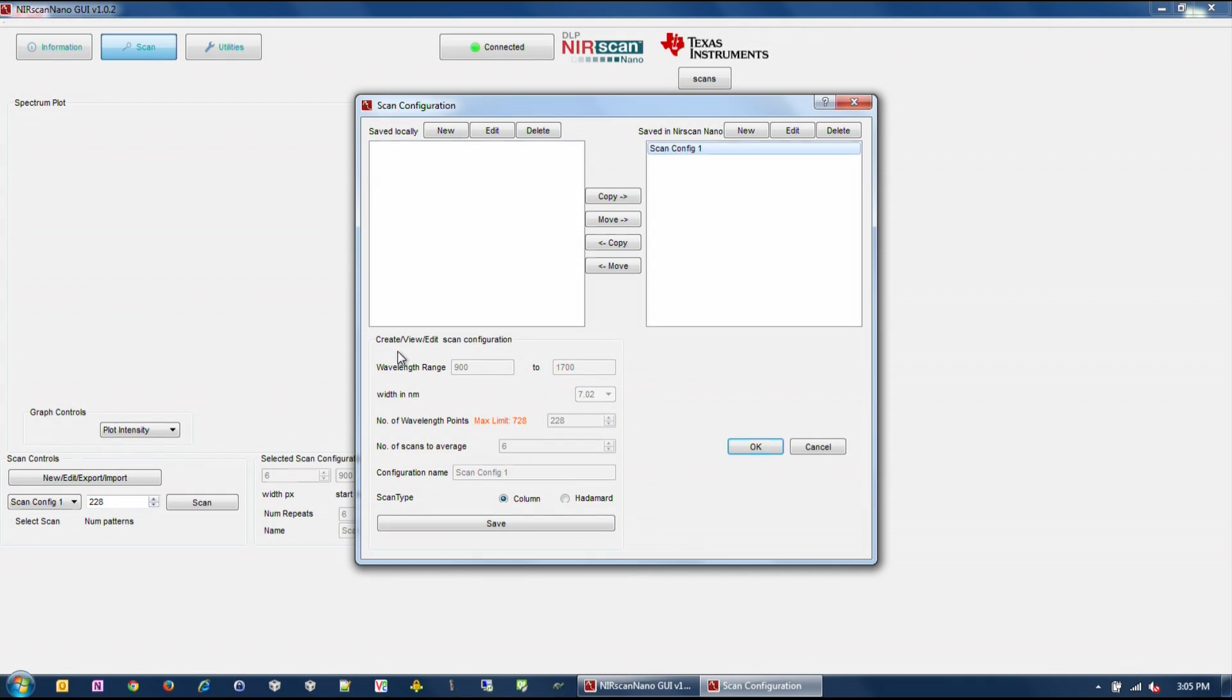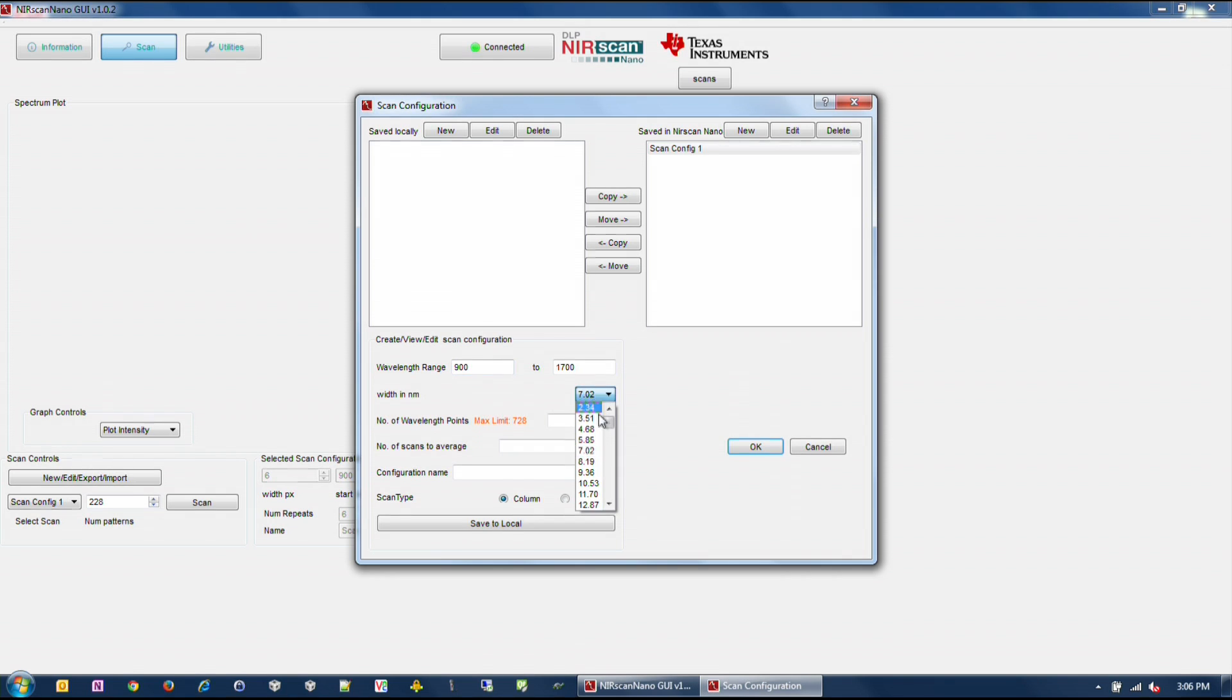Click the New button on the top left section of the Scan Configuration dialog box. Then type the desired spectral range between 900 and 1700 nanometers. Select the width in nanometers that corresponds to the smallest wavelength content that you want to resolve.